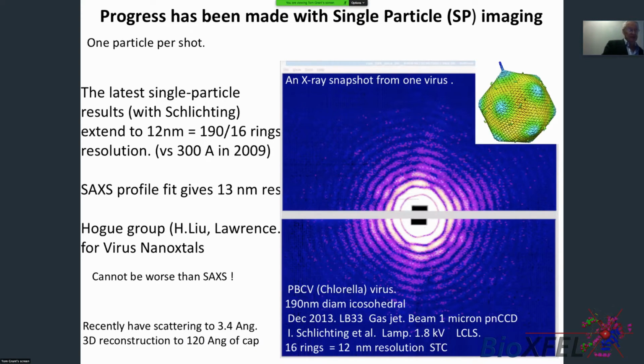What's the hit rate in the LCP? Is it sort of 20, 30, something like that, right? When we do these experiments, it's a completely different world. You stand there in the control room, looking at the screen, and nothing happens. Then every now and then a cheer goes up as you get one pattern. So the hit rate is 0.1%.